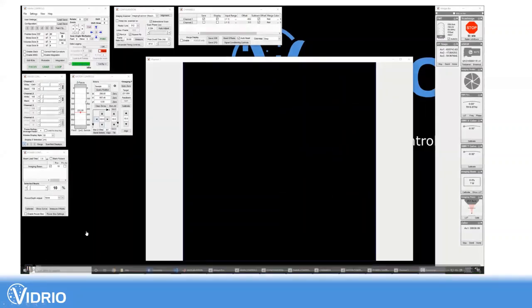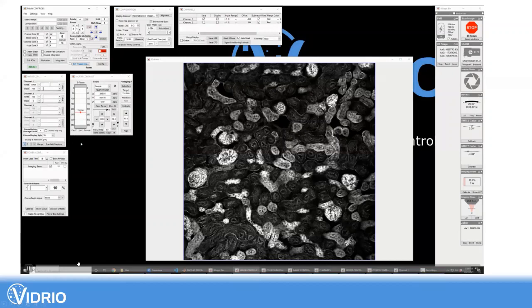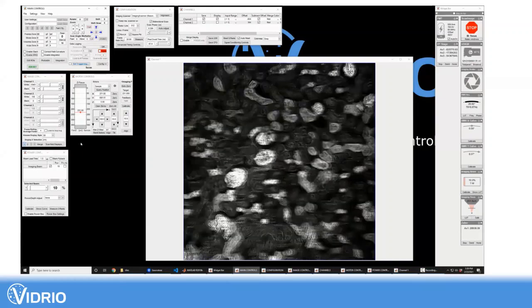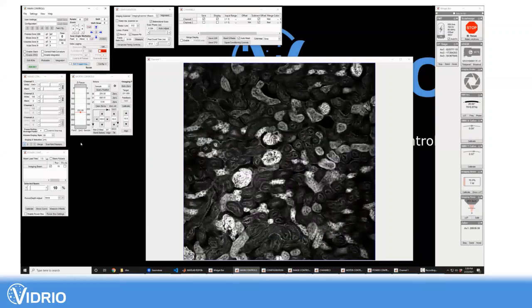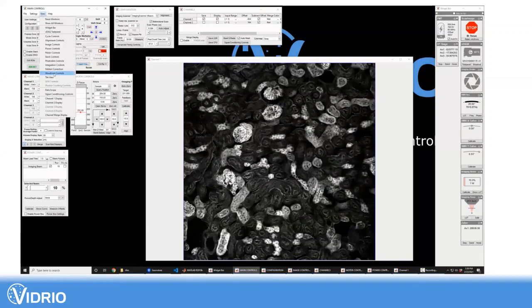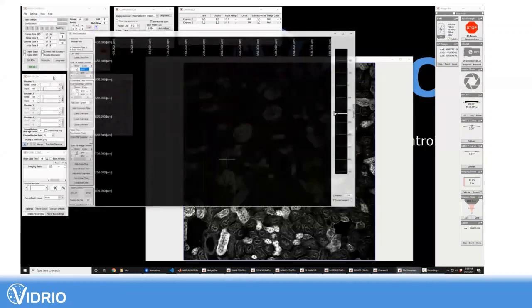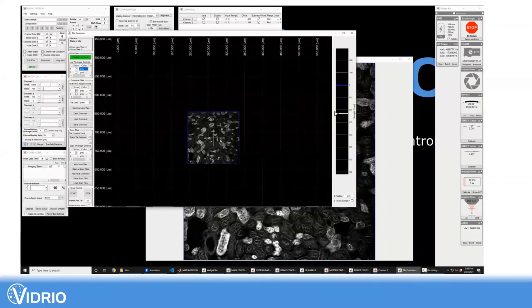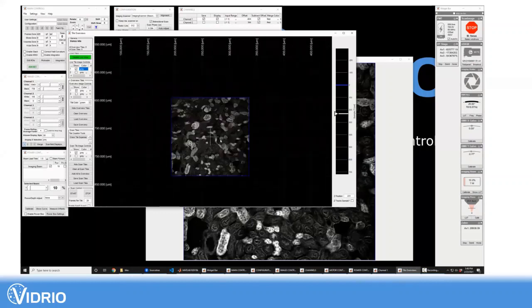And so basically, you can see first you would do a focus to get an image that you want to look at or center around. This is just a kidney slide on our confocal microscope, and then you'd select this new tile view, and you disable the live view, and so you've now got your initial image in the center.